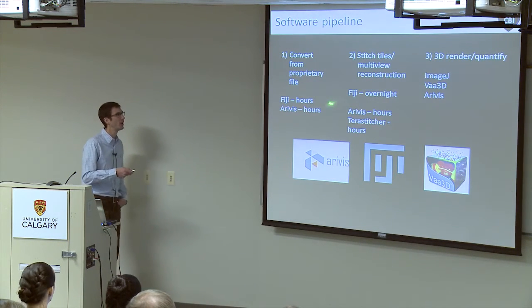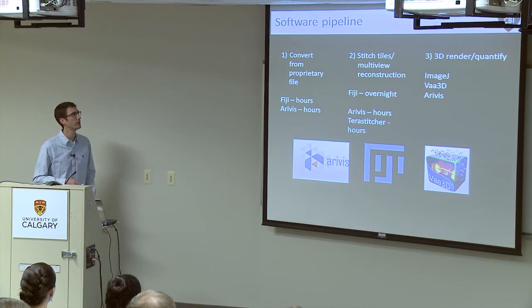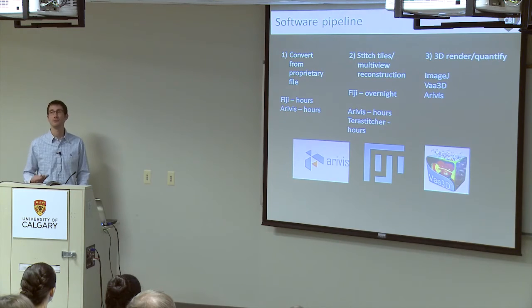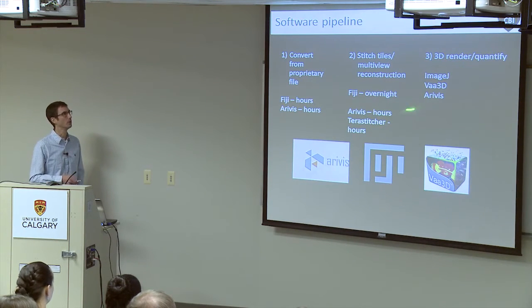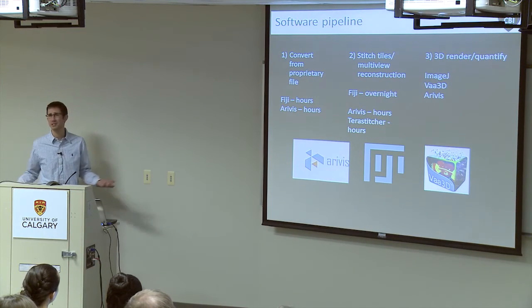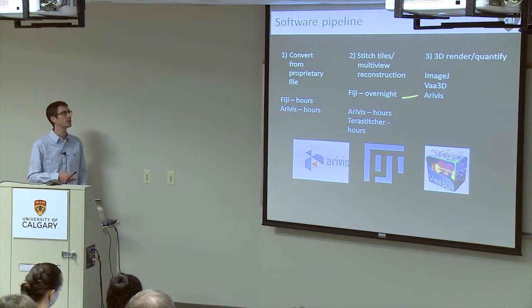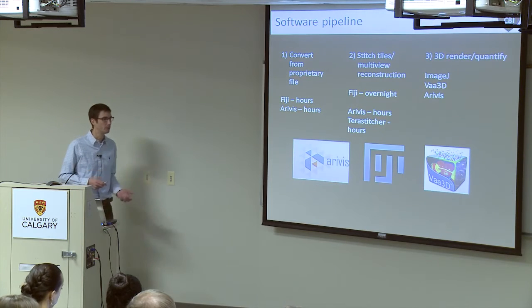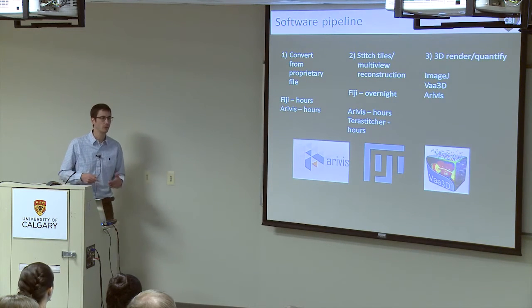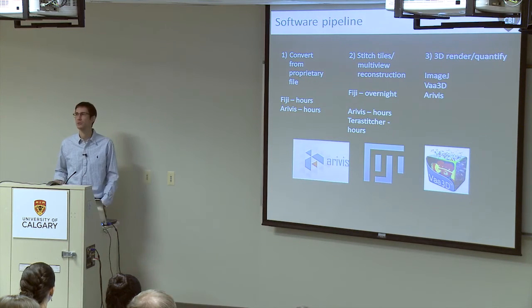So Stefan Preibisch, who used to be at Janelia Farm, now has his own group in Berlin. He's written some phenomenal Fiji plugins that will allow you to process this multi-view. If you just have a single time point for all views, it maybe takes half an hour. If you have a really long time-lapse data set, it's going to take overnight. We've actually, and other people have actually altered the code or worked on the code to put it on a cluster environment as well. So then you can do it in a couple hours on a cluster environment.